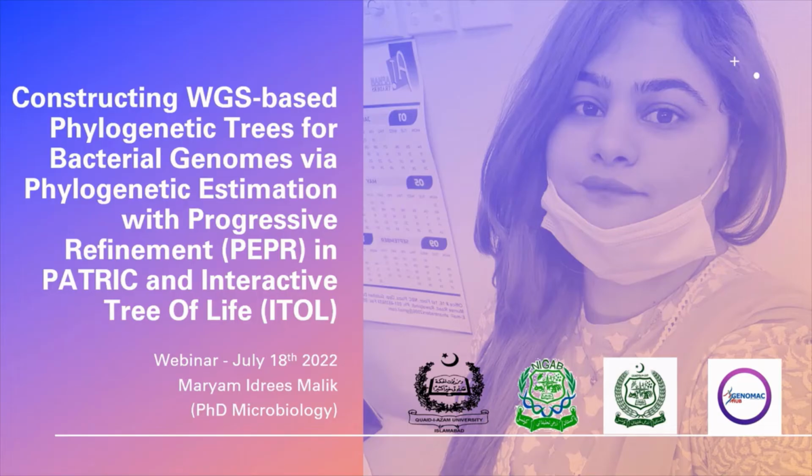In today's talk, I will focus on how to construct a phylogenetic tree using whole genome sequence data via Phylogenetic Estimation with Progressive Refinement service. And then I will discuss how to edit your newly constructed tree. Guys, I know it sounds a bit complicated right now, but buckle up. At the end of this talk, I promise you will definitely get the hang of it.